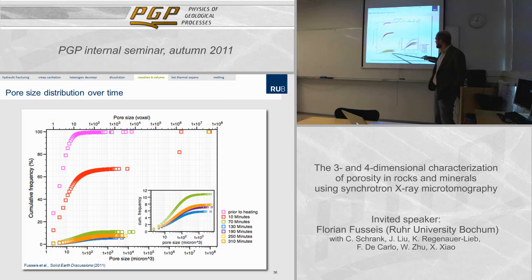And that changes dramatically, and what you can actually take away from this diagram is essentially that after, say, 130 minutes, when the front has propagated through that volume, all the important part is actually formed by one pore, which is not one pore in the sense that we understand it as a geometrical feature. It's one interconnected cluster of pores. That is what the software returns at this stage, because we're not yet ready to distinguish interconnected pores and separate individual ones out.